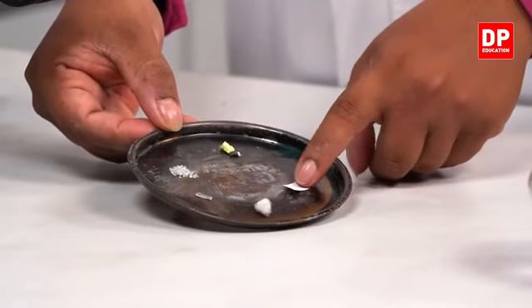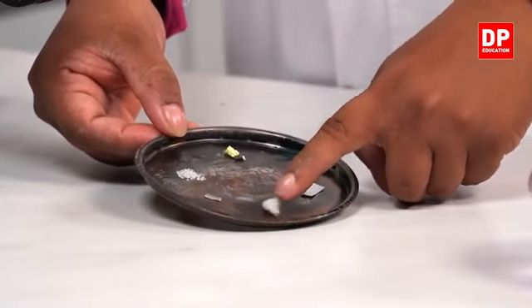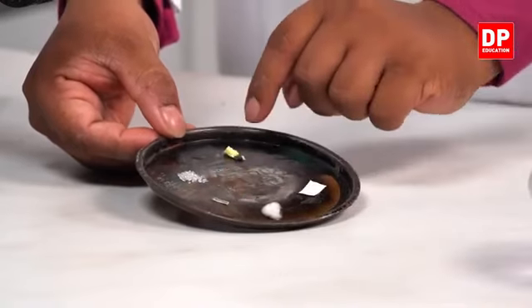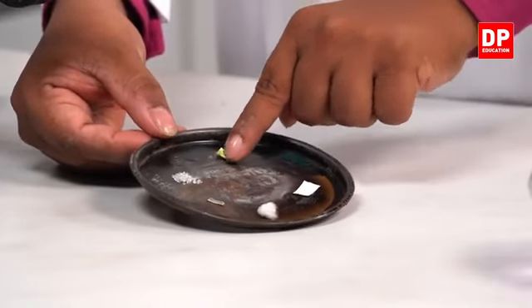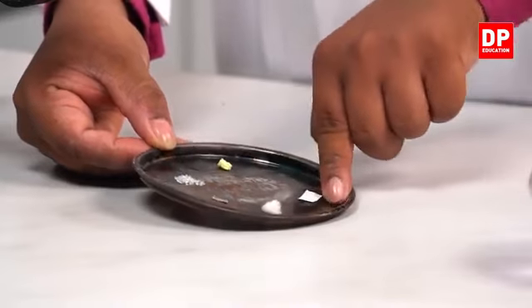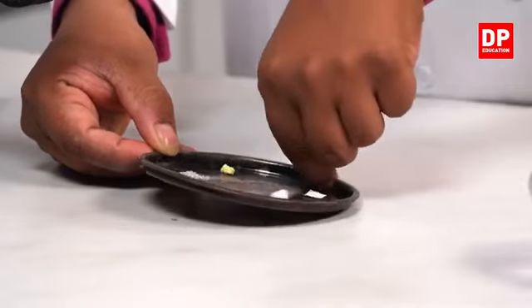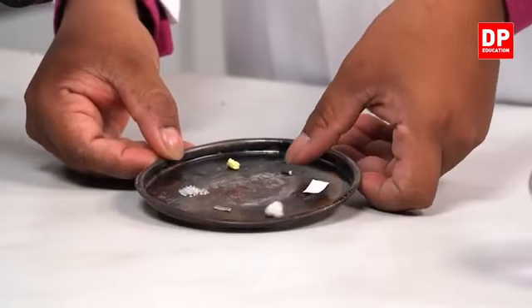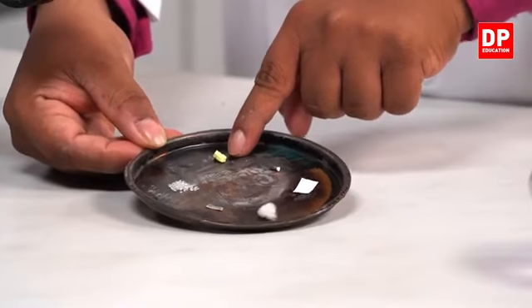Here you can see a small piece of paper, a piece of cotton wool, a piece of magnesium, some sugar crystals, then a matchstick head, actually the head of the matchstick, and a piece of sulfur.